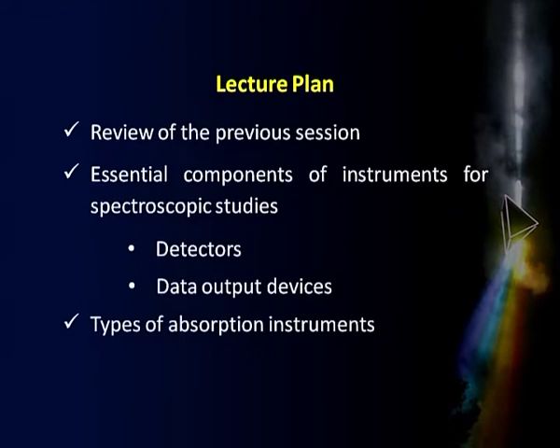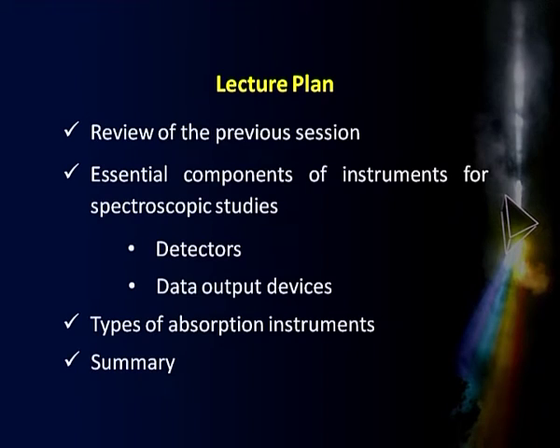And then we will take up different types of absorption instruments used for the purpose. In this context, we will talk about 2-3 different types of instruments used, and towards the end we will sum up what we do today.